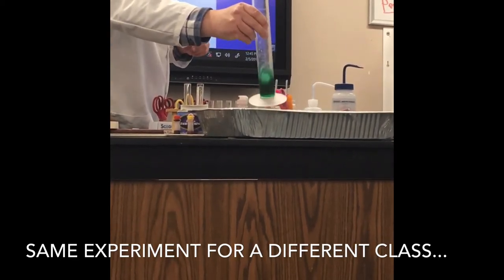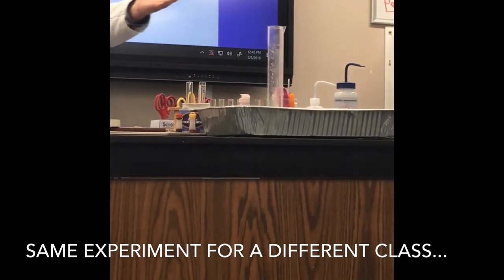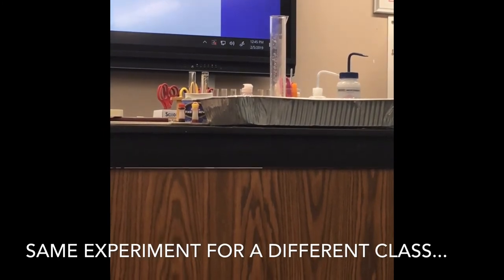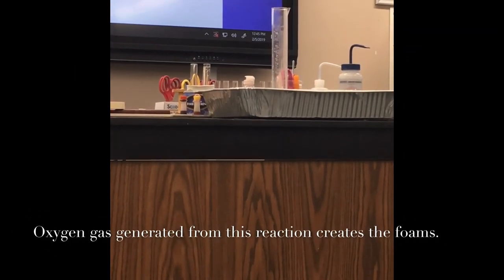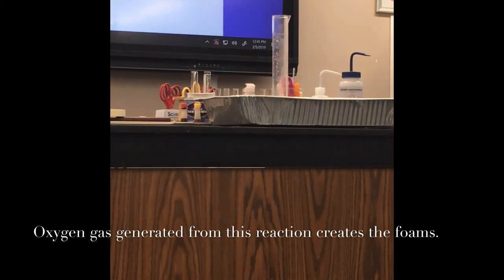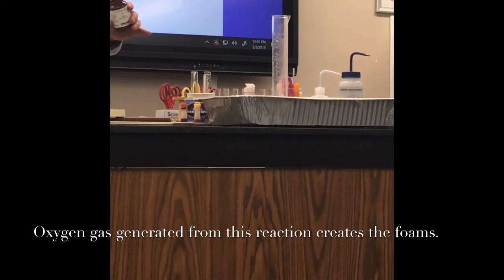Whoa. Okay. Guess what? There's no reaction. Why not? What's missing? The catalyst. You need the catalyst. What's the name of the catalyst? Potassium iodide. Here it is. Pay attention. The reaction is not going to happen until you add the catalyst.